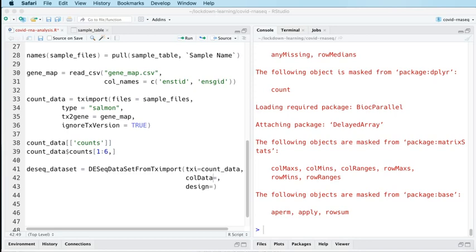So that explains that. Let me just find out exactly what the dependency is. Package XML Linux stats. libxml2 dev is the package. I'll just type that in the comments. There you go. Okay, so hopefully that will get people back on track.